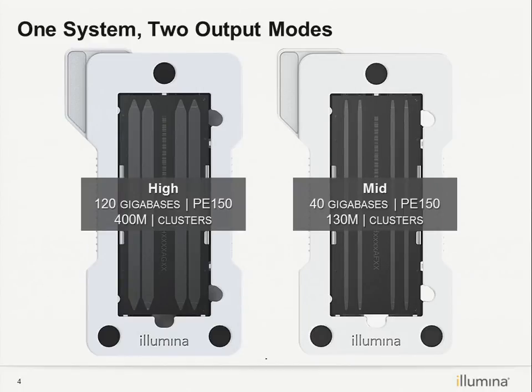I guess you're familiar with the output and reads, right? For RNA people, usually they look for the number of reads available for each sample. But for DNA people, they will calculate the coverage, and that's why they need to know the total output. So it's a basic calculation: the reads times the read length is the output.